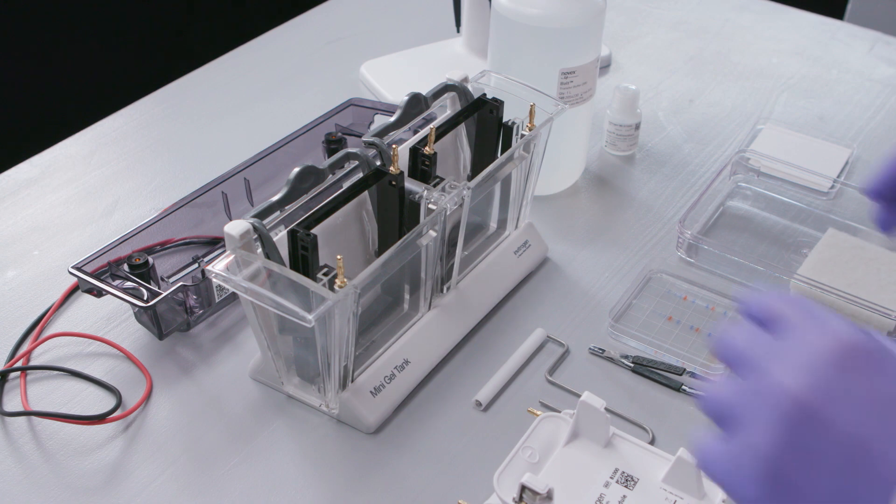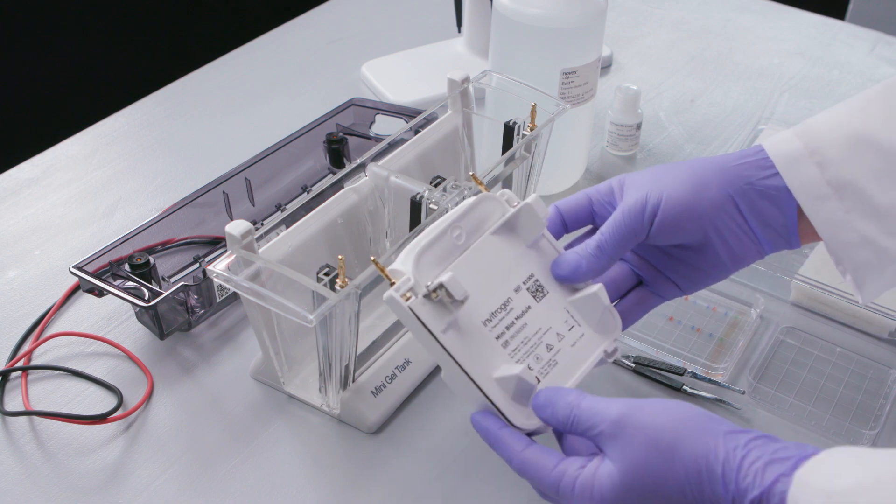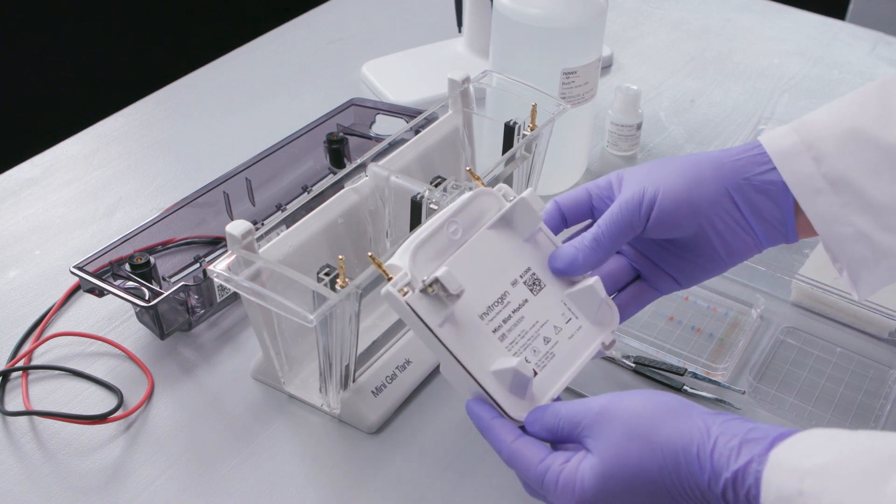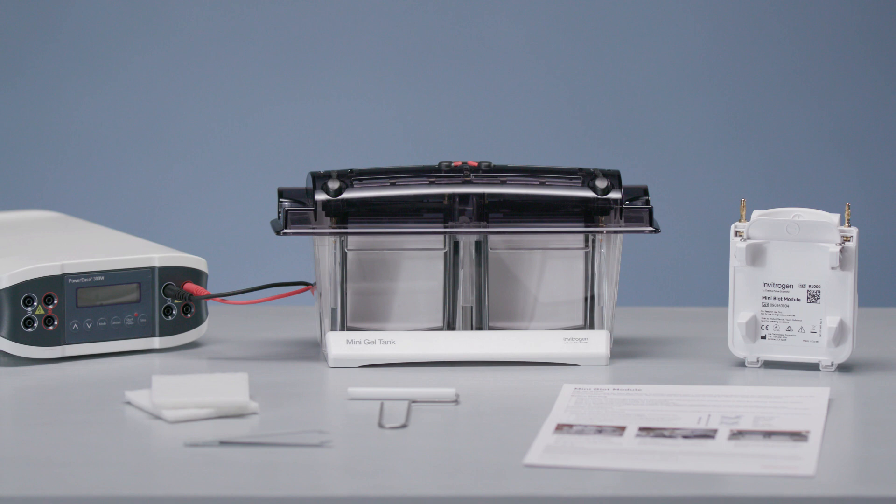Make sure the cassette clamps are removed before you set up your transfers. One gel is transferred per module, and two modules fit in one tank. Included with the mini blot module kit is a roller, sponge pads, tweezers, and a quick reference card.